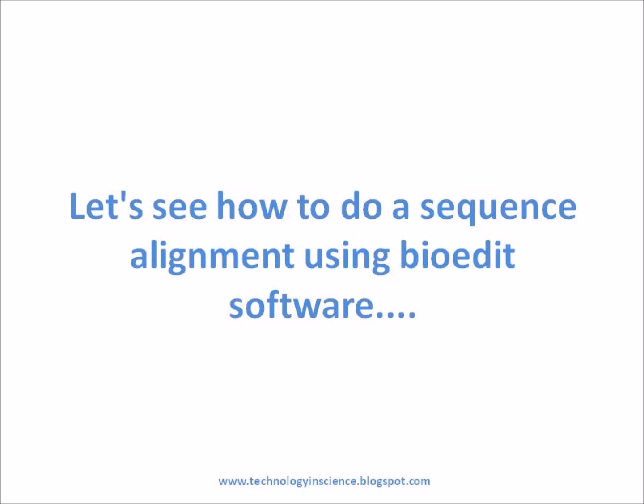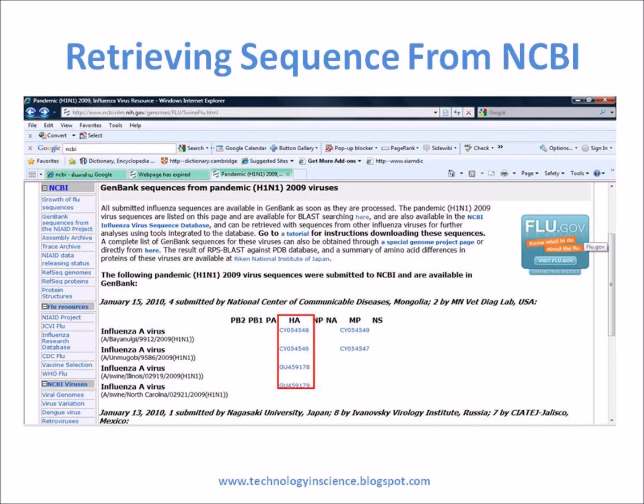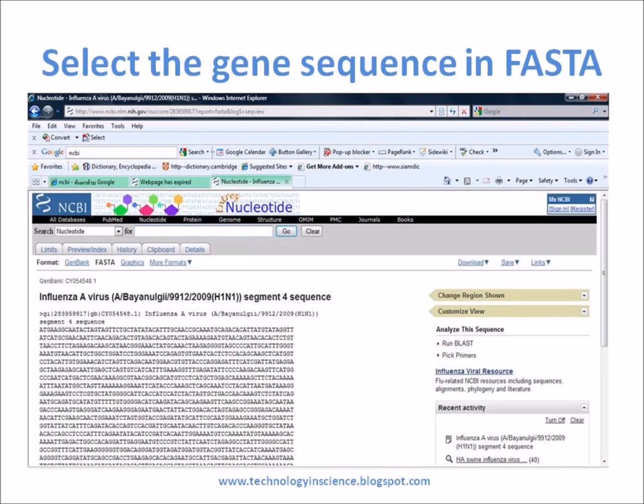First, you have to get the sequences of your interest — it can be a whole genome sequence or a particular gene of interest. The sequence can be retrieved from the NCBI website. For example, let's search for the hemagglutinin gene of H1N1. You can save the selected gene sequence in FASTA format, which can be used in BioEdit software.